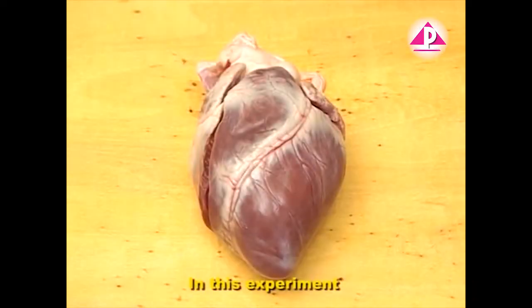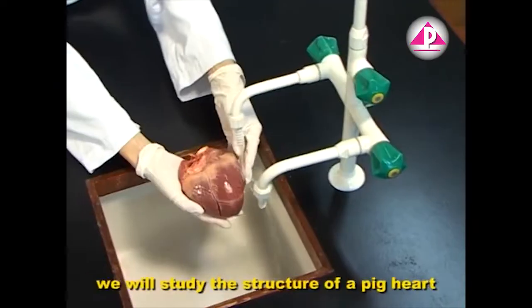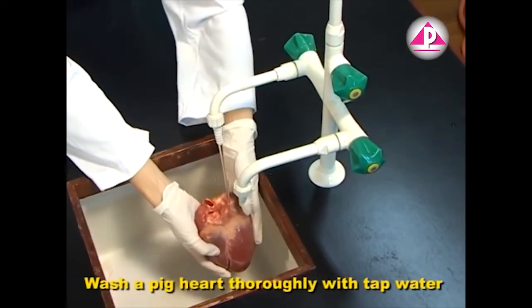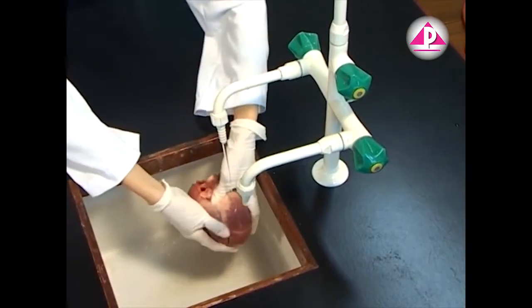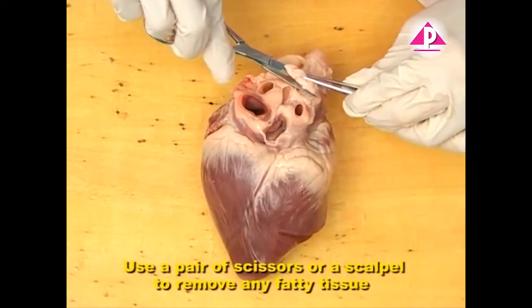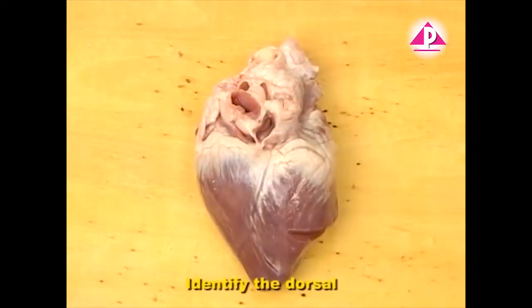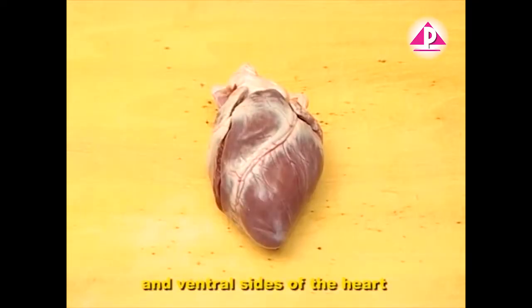In this experiment, we will study the structure of a pig heart. Wash a pig heart thoroughly with tap water. Use a pair of scissors or a scalpel to remove any fatty tissue that surrounds the blood vessels of the heart. Identify the dorsal and ventral sides of the heart.